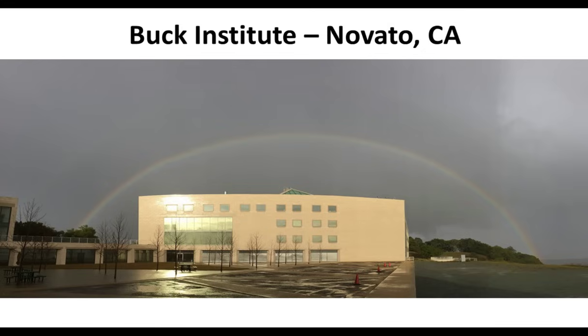Okay, so maybe I start with answering this. So yes, we definitely have a high interest in expanding the portfolio of one-pot enrichment antibodies, or adding other PTMs to it. In fact, the ones that were asked about, specifically ubiquitination and methylation, would fit very well for adding into the one-pot enrichment. The reason being that the only thing one has to consider is the workflow and the solvents and buffer that work for all the antibodies that would enrich the specific PTMs. As Matt mentioned earlier, CST antibodies are also available for ubiquitination and methylation, and they use a very similar set of conditions to perform the enrichments. So that should work very well, and we have actually started with some pilot experiments doing this.